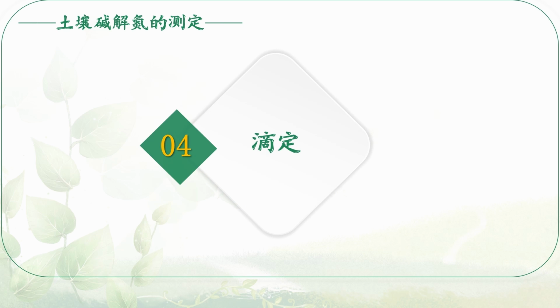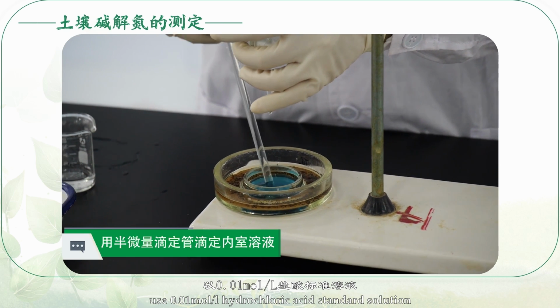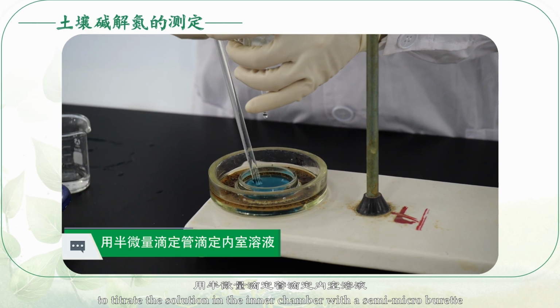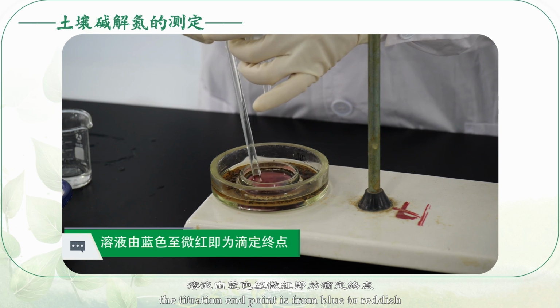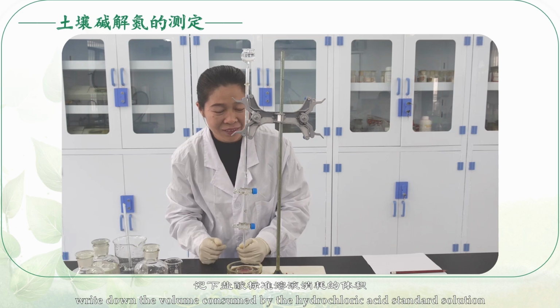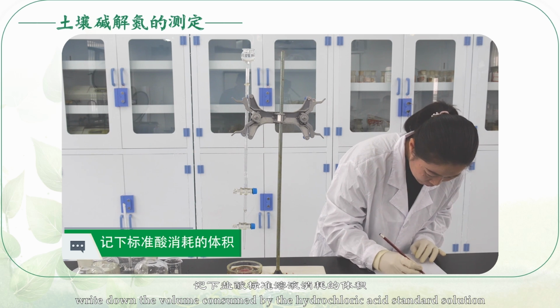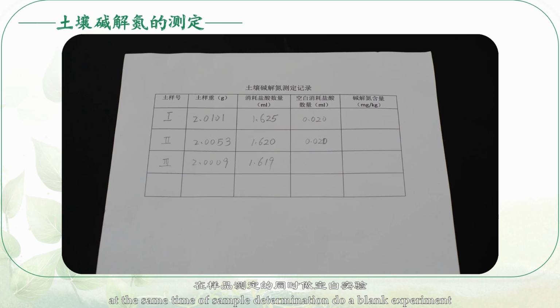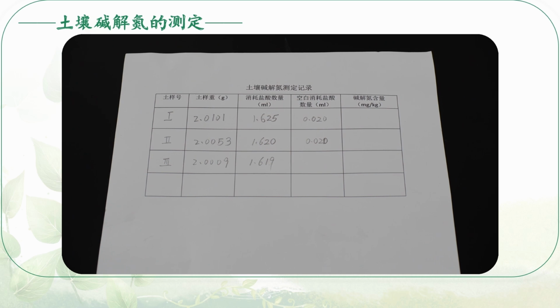Titration. Use 0.01 moles per liter hydrochloric acid standard solution to titrate the solution in the inner chamber with a semi-micro burette. The titration end point is from blue to reddish. Write down the volume consumed by the hydrochloric acid standard solution. At the same time as sample determination, do a blank experiment, except that no soil sample is added. Other steps are the same as for the sample determination.